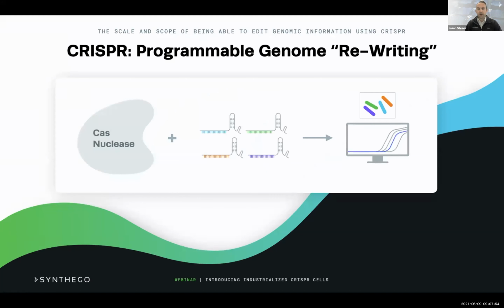And when we're talking about programmable, essentially in a similar sense as software, you can actually code the sequence that you want to modify. And you can do so in a sufficiently scalable way simply by printing, in this case, many, many guide RNAs. So this allows you to essentially arbitrarily address any part of the genome, and as a consequence, arbitrarily address any part of a biological network at a scale that is truly enabling and is the complement to the work that we've been sequencing.